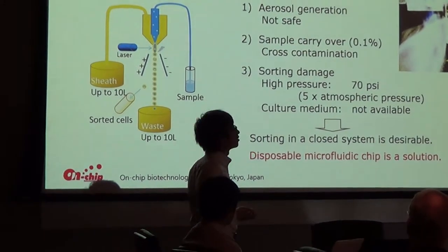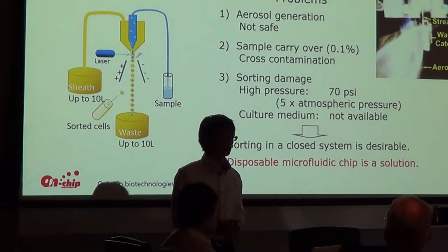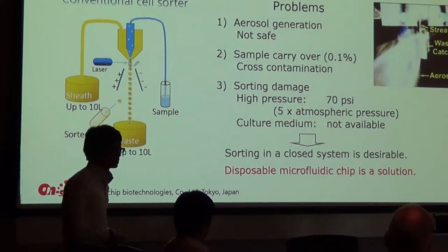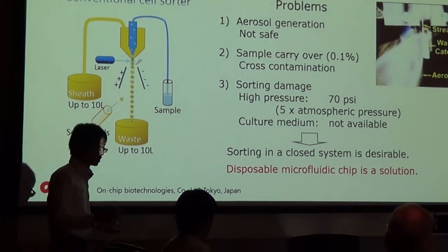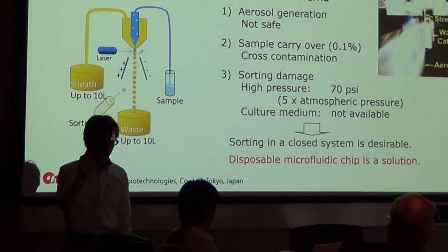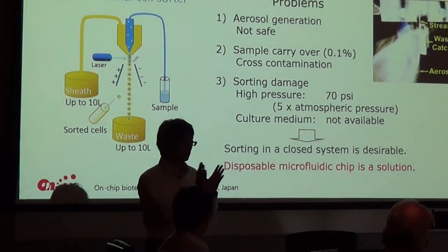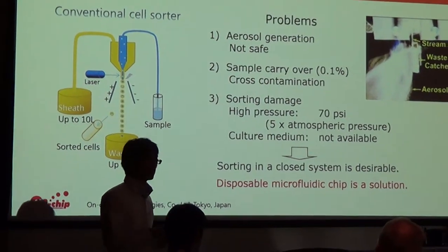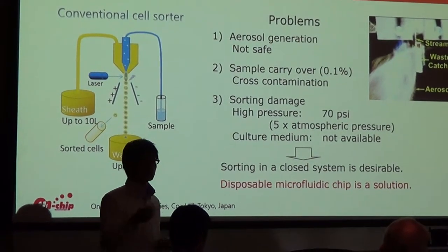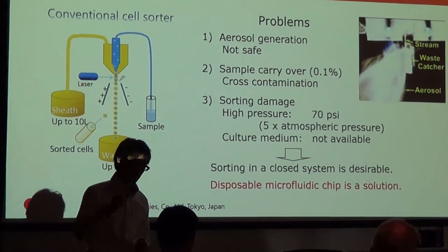So a few other problems with the conventional sorters are, as Eric mentioned earlier, the aerosol generation. If it was something really toxic or really harmful to you, you obviously don't want to be standing around it. And sample carryover, which means that whatever samples you're running, you're letting them run through the same cuvette, as cuvettes cost a lot. And so whatever is stuck in the cuvette, if you try to run another sample with completely different media or whatever you're using, you may have a bit of cross-contamination from the previous one.